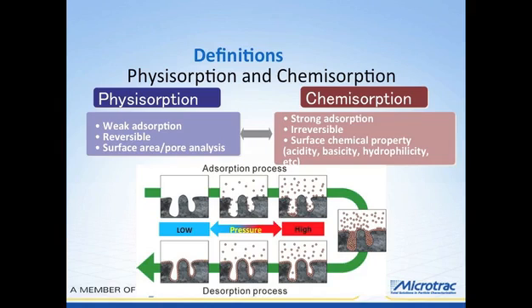So as we start to reduce the pressures, molecules that have filled the pores now start to remove themselves from the surfaces, and as the concentration and the pressures decrease, the final result is that molecules that have chemically reacted with the surface now line the particle and the interstices of the particles. So there is a difference in the final point of physisorption and the final point of chemisorption.